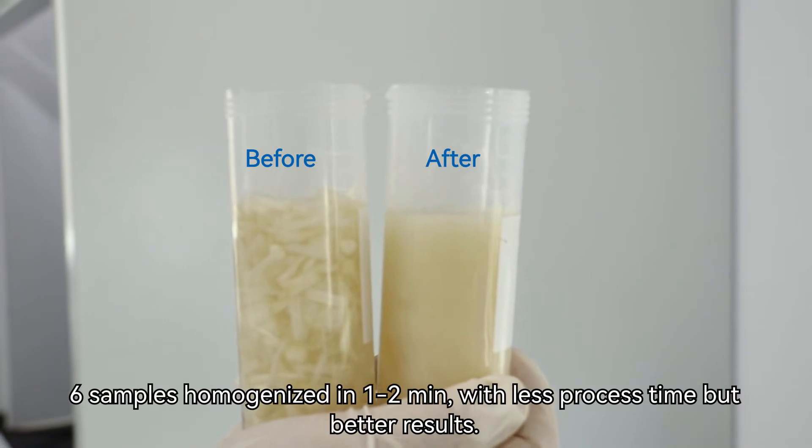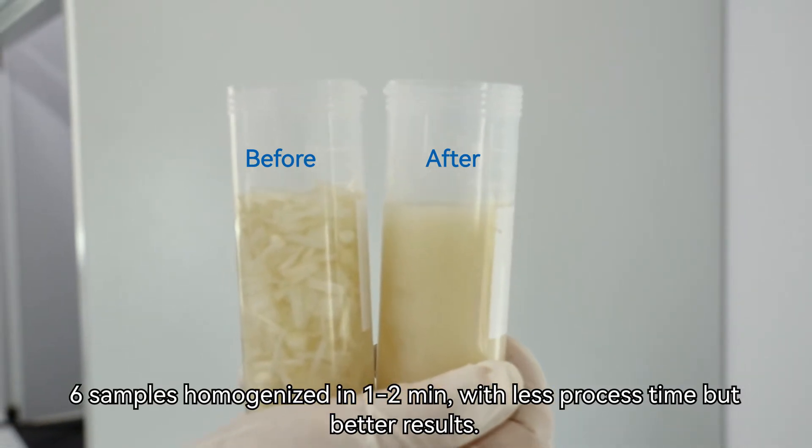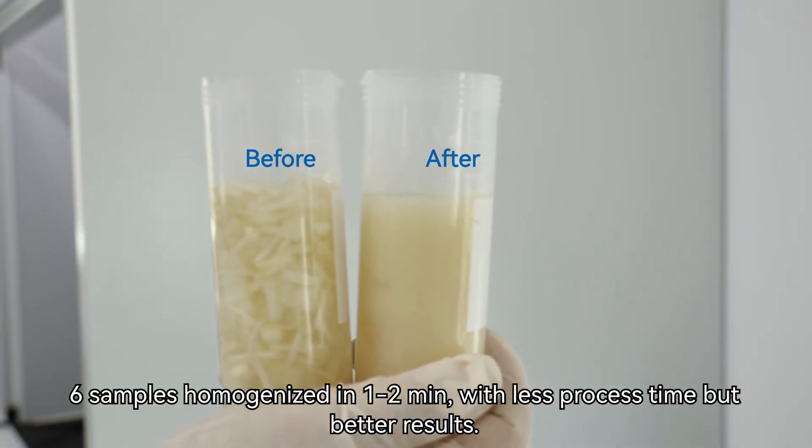Six samples are homogenized at the same time within one to two minutes, with less process time but better results.